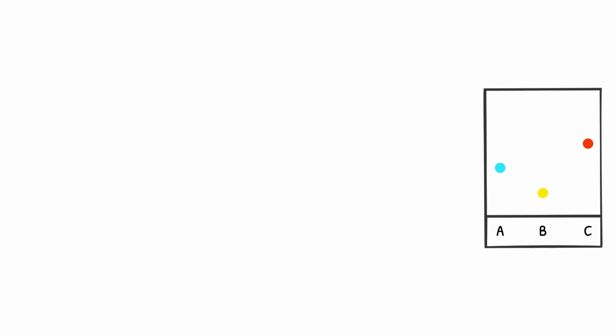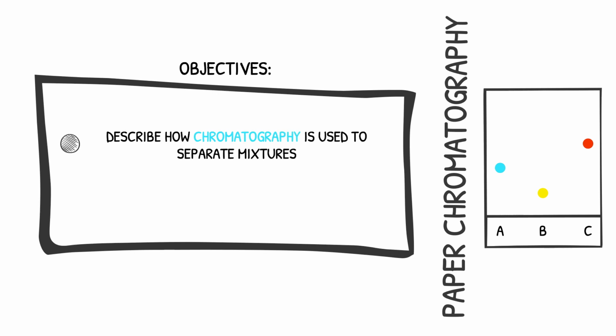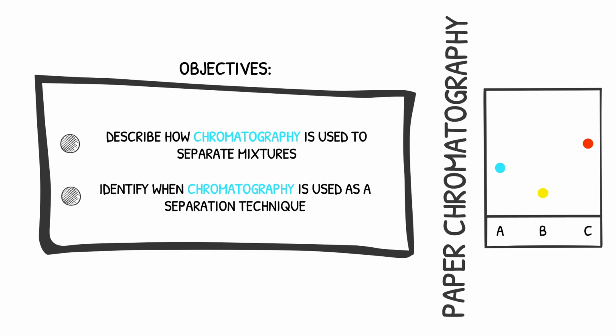In this video, we are looking at how mixtures are separated using chromatography. By the end of this video, you should be able to describe how chromatography is used to separate mixtures and identify when chromatography is used as a separation technique. So, let's go.